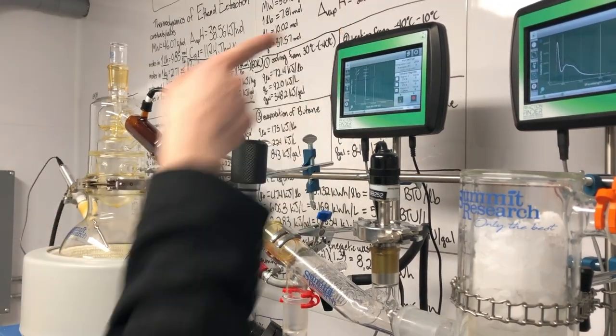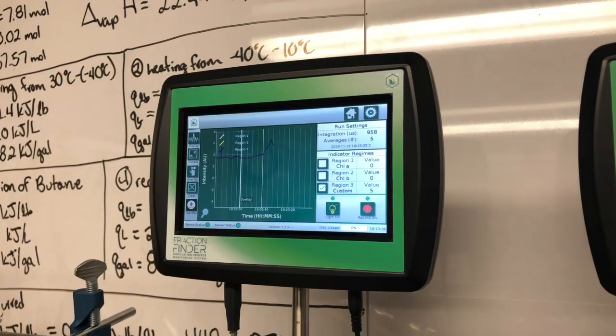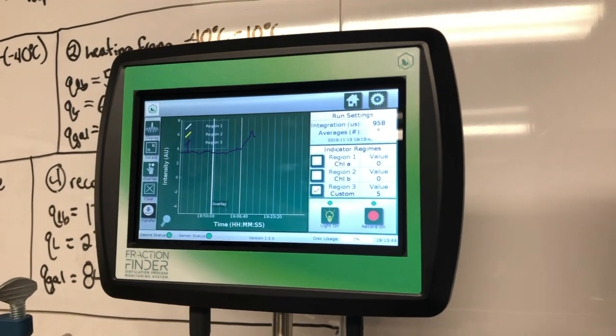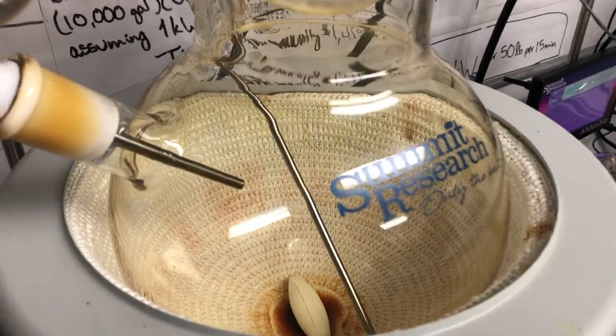Anytime you see that uptick at the end, that means you're done. It means we're transitioning to tails. That's what that is. On the left-hand side, the uptick at the end is always what means that you're going to tails. We ran this whole thing.